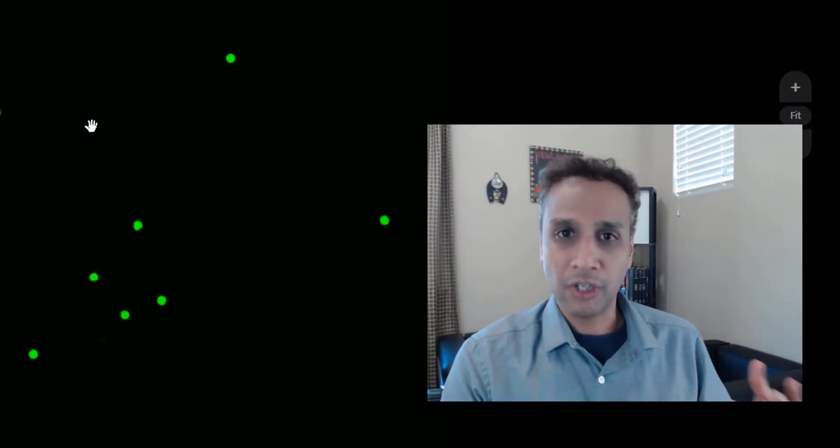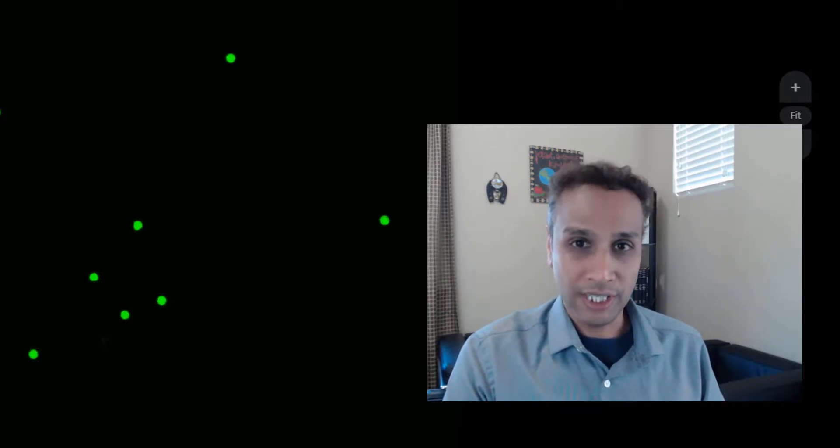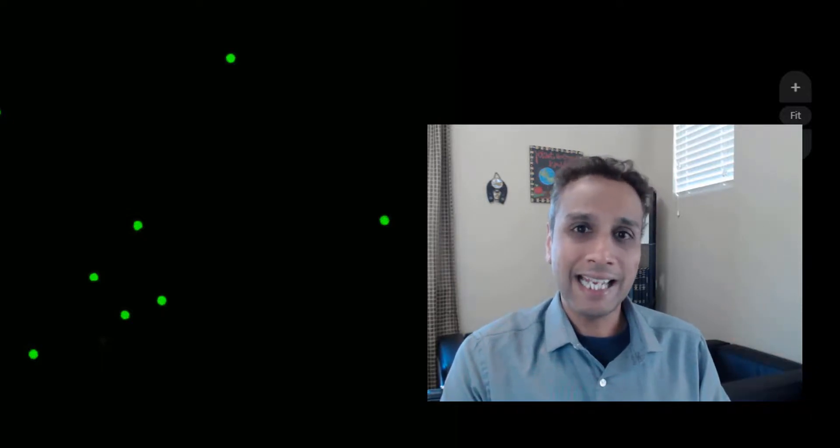Eventually it comes down to segmenting these objects against the background and providing that segmented image as an input to the tracking module.